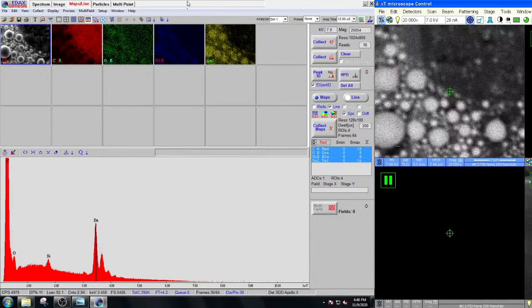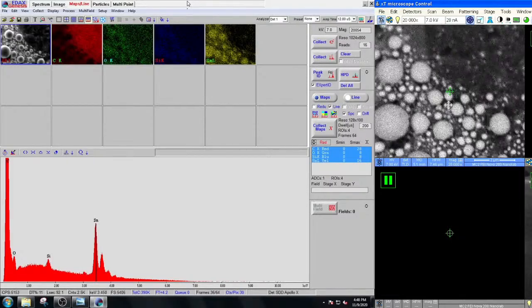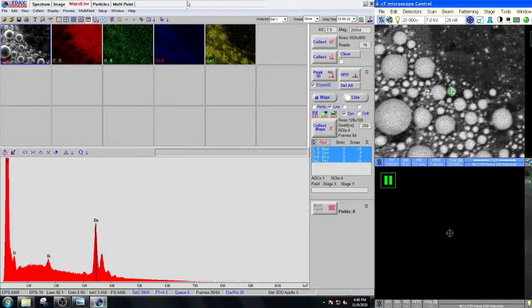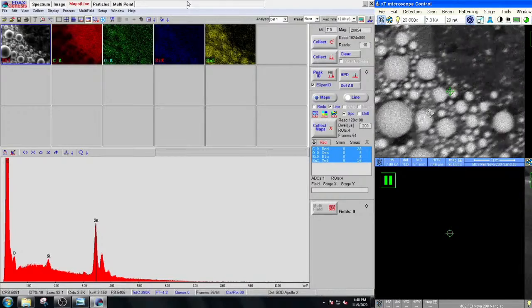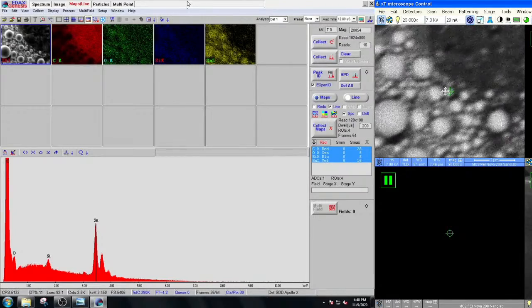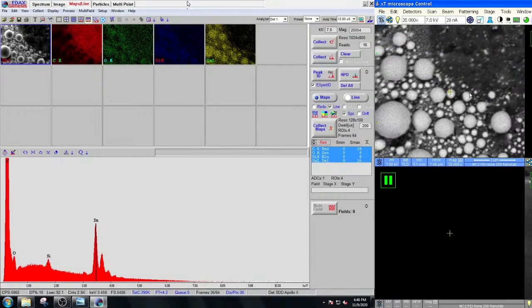And let's make sure our image is good here. Now, for any of you watching this that don't really know how to set up the Nova, I would recommend checking out some of the other videos we have online that talk about just basic SEM operation of the Nova for doing alignments and astigmatism and things like that.